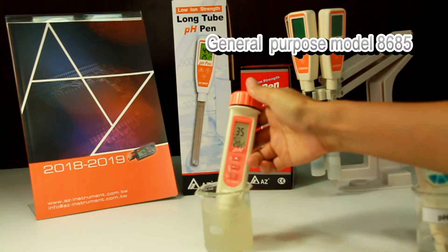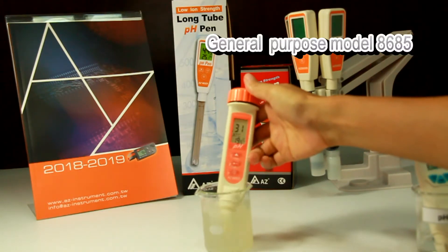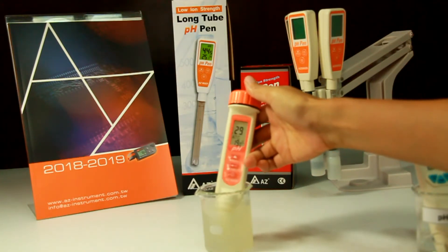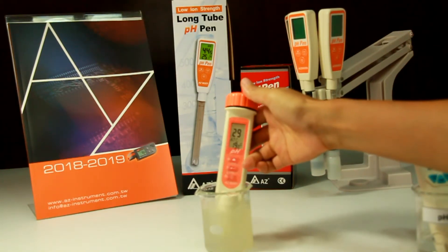If you want to measure the PH value of lemon juice, you may use the model 8685 regular glass bulb PH electrode. Stir gently to get the PH value.